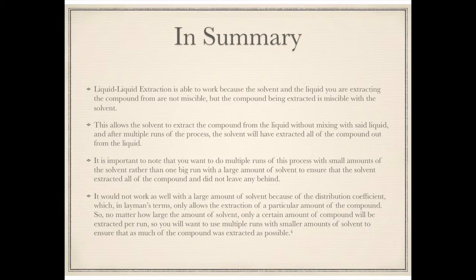Now this was just a very brief overview of the distribution coefficient, as it would not be able to be covered in a video this short along with the other material. However, the brief overview of the distribution coefficient that was discussed should be enough to help you understand why you must use multiple extractions with a small amount of solvent rather than one extraction with a large amount of solvent. As well, I cannot mention the distribution coefficient without saying this about it. The distribution coefficient is what determines the amount of solvent used per run and how many runs you need to complete to extract the compound using liquid-liquid extraction.